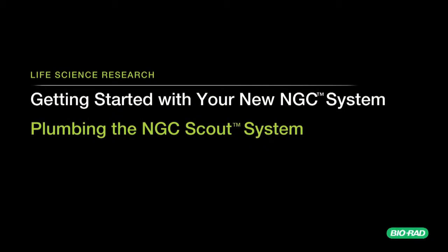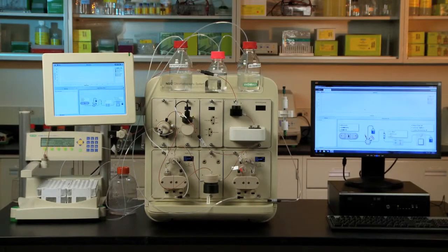This video shows how to install plumbing on a new NGC Scout 10 or Scout 100 system. When installing plumbing, tighten all fittings into their ports.